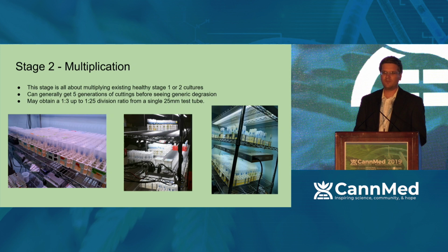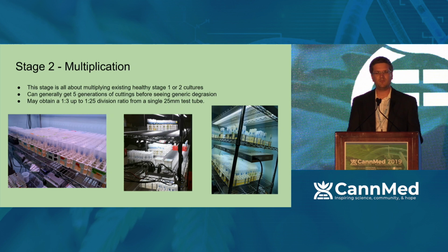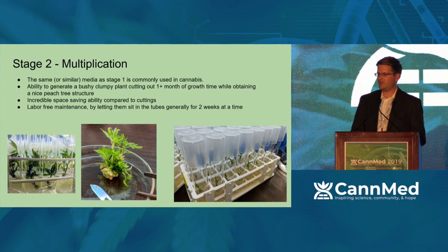Now, you only want to keep a plant in stage two, or I guess in culture, for no more than 5 generations at a time. If you do more than that, you start to get genetic degradation the same way that holding onto a 20-year-old cutting would have. So, just not a good idea. Stage two, the multiplication stage, has quite a few advantages over just typical cuttings as well.